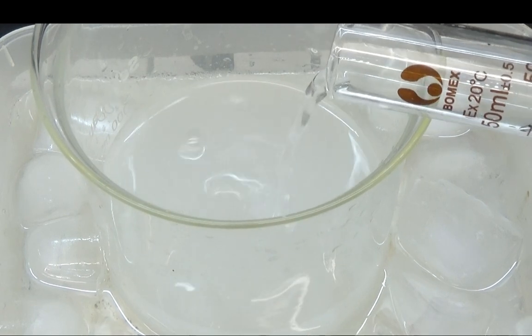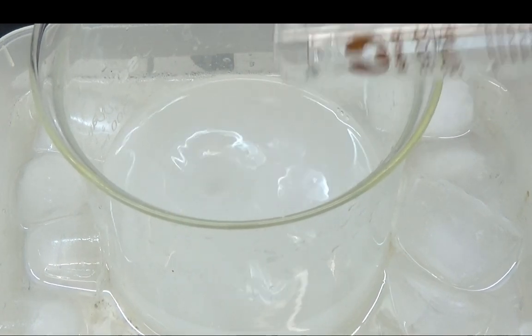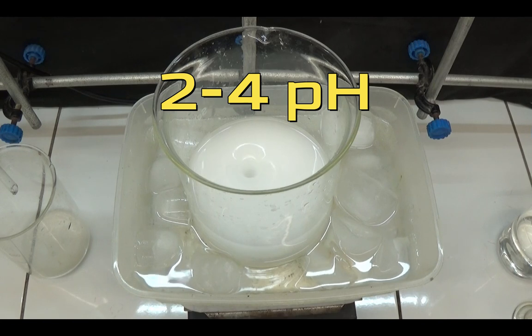In total, 35ml of diluted hydrochloric acid has been added, resulting in a pH between 2 and 4.